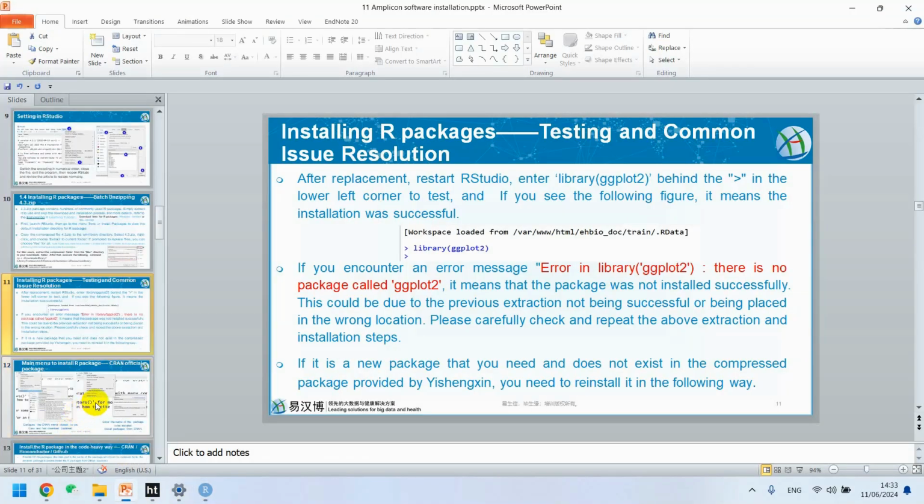While running the pipeline, you will encounter this kind of error, that this package is not found. Then you simply go to the console area and start downloading, following this procedure, and just write the name of the package and run it.